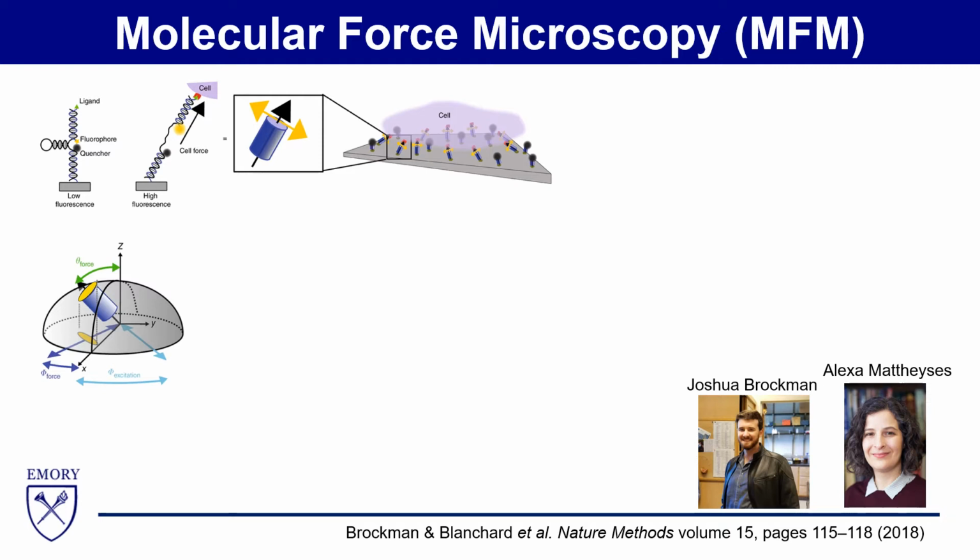As you can see here, the xy projection of the force runs right through the short axis of the ellipse. This means that if you can rotate the electric field and find the angle that minimizes your fluorescence intensity, you can measure the in-plane angle of the force. Furthermore, the shape of the ellipse is related to the tilt angle of the force. If you point this thing straight up, the projection of the disk is just a disk. But the more you tilt the force over, the narrower the short axis of the ellipse becomes. Therefore, if you can measure the ratio between the maximum and the minimum intensity values, you can also estimate the tilt angle of the force.